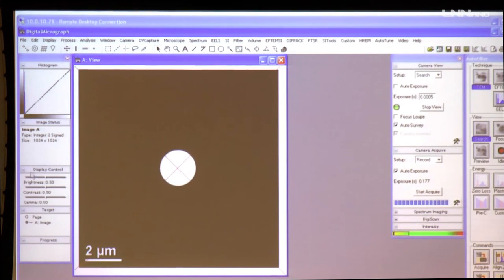So now it's in the X direction. I used one key here, the option for using X and Y. I have used the X direction, and X seems to be OK. But I feel it is more in this direction, so I try to correct Y as well. If I go further in the Y direction, it's very bad, so I go back. Now again it's really bad, but in the other direction of Y. So I try to come to the center point.